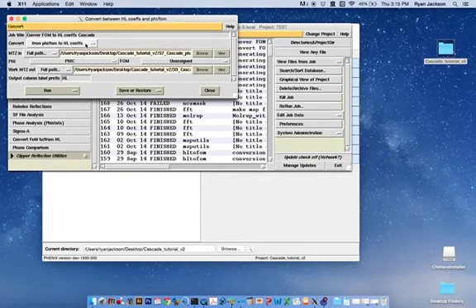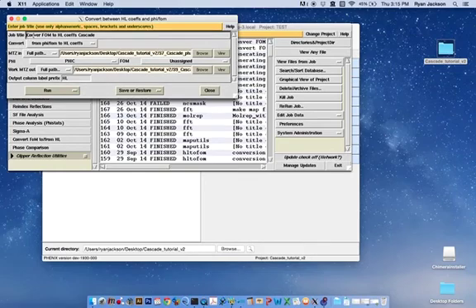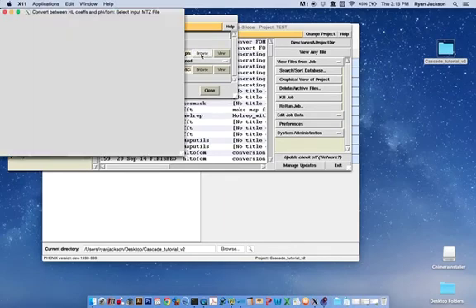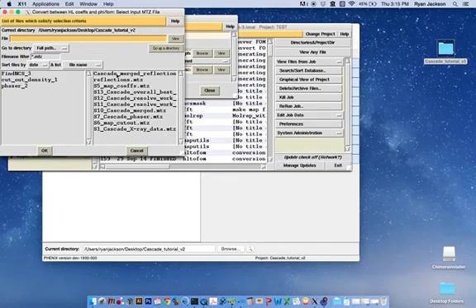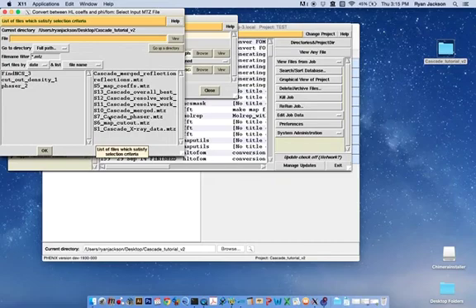Here, we need to change FOM to HL coefficients. We want to give it a job title that makes sense. We need to find the path to our phaser solution, which, if you're working from the tutorial, is Supplemental File 7, or it's the MTZ file that was produced by your phaser run.